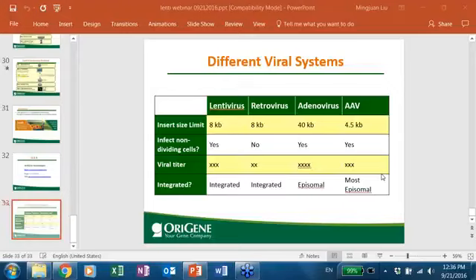Yeah, that's a follow-up question about the integration site with lenti in cells. If integration is random, how does silencing of specific genes work? Yeah, this is the problem with random integration. For most research, it might be okay, but if you are concerned, please use the CRISPR-mediated AAVS1 insertion.